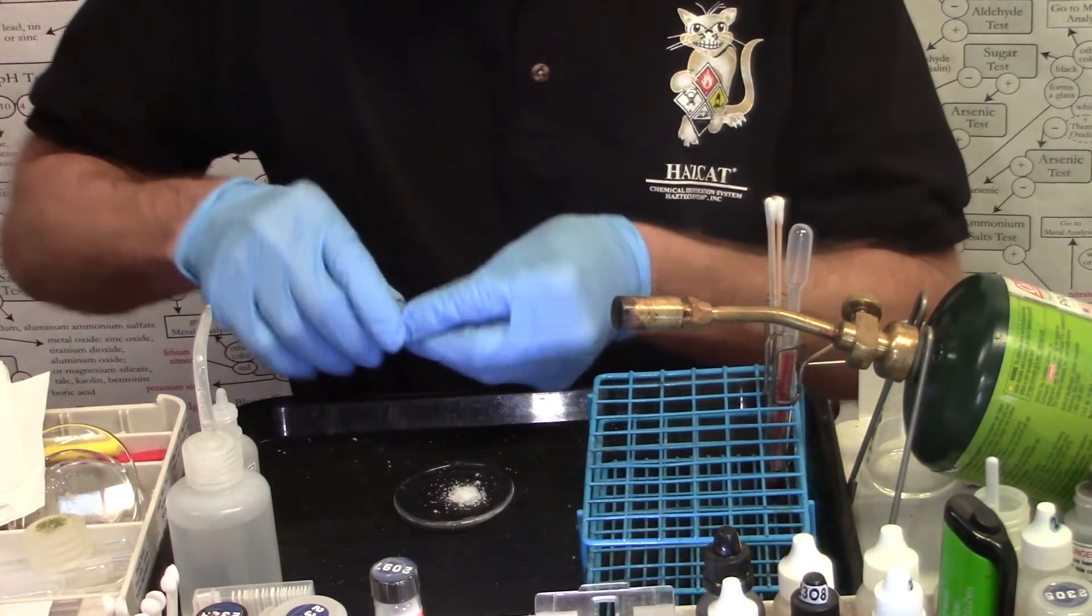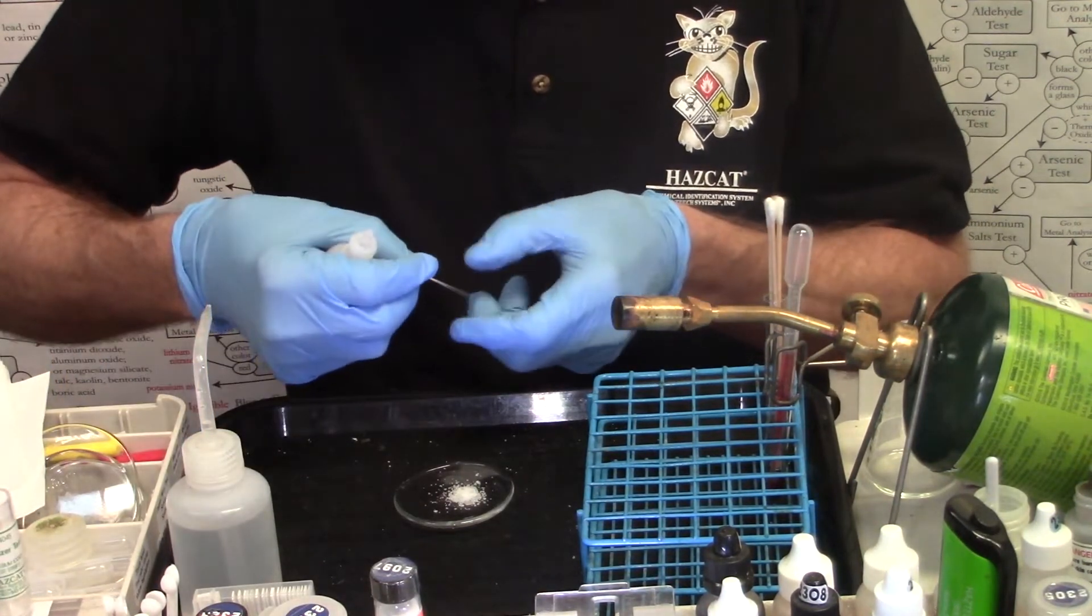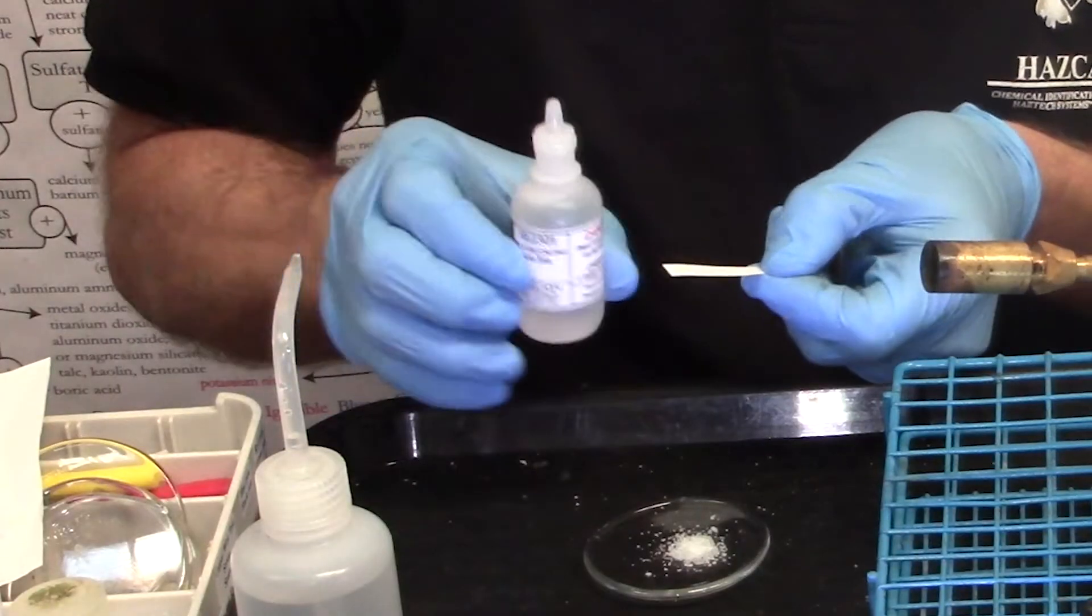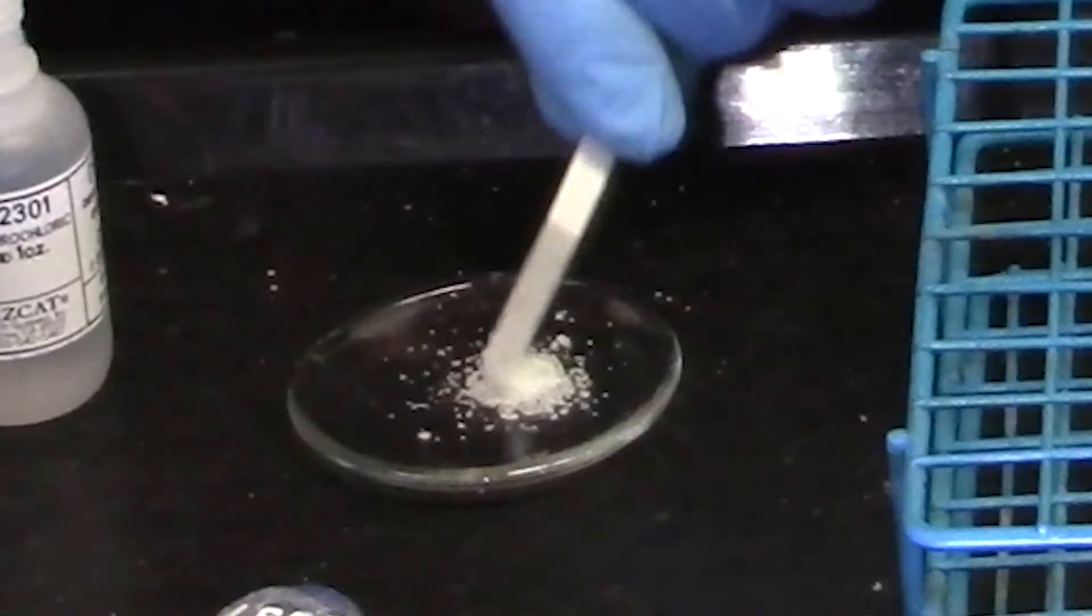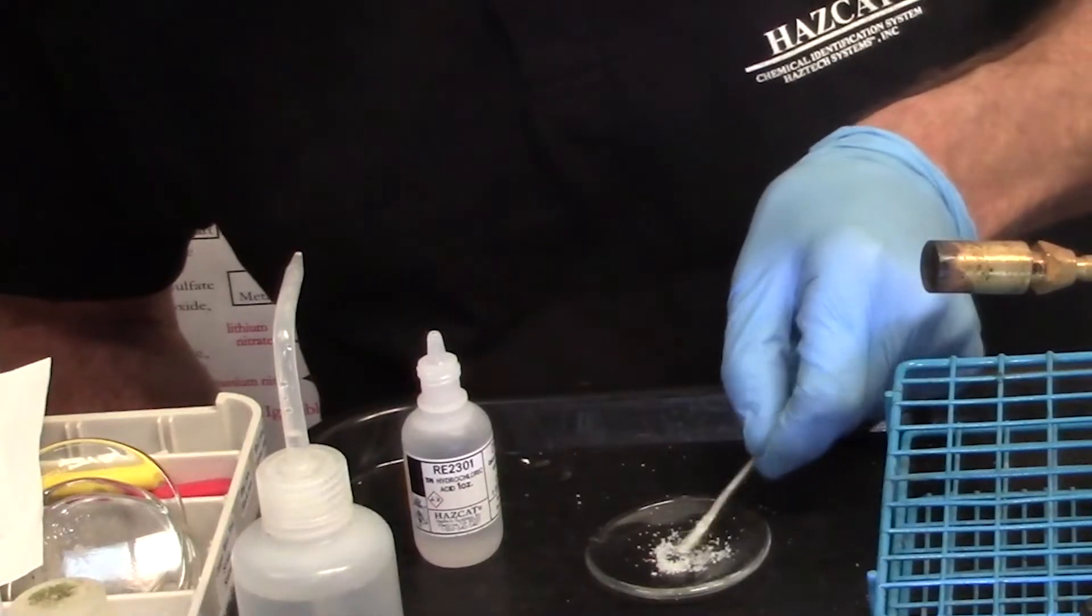Take my strip of oxidizer test paper. Wet it with two drops of RE2301. One, two. And then one one thousand, two one thousand, three one thousand. Lift, look.